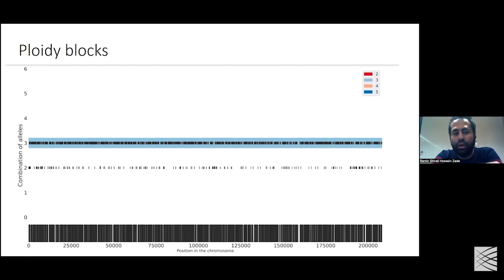And it goes over the whole chromosome. The reason that HAT could phase this chromosome start to end, telomere to telomere, is that there are lots of SNPs, it's highly heterozygote. And as you can see, there are lots of SNPs between the haplotypes, and HAT could use them to reconstruct the haplotypes.